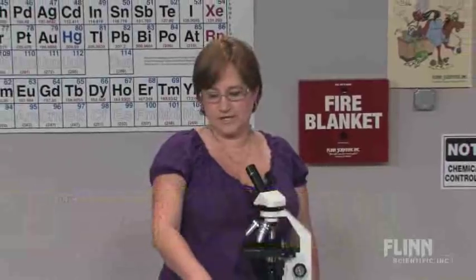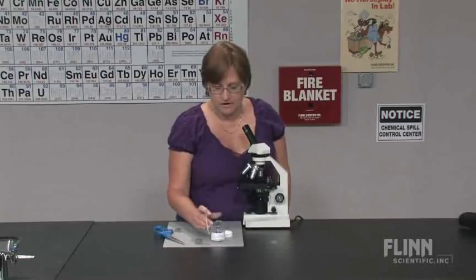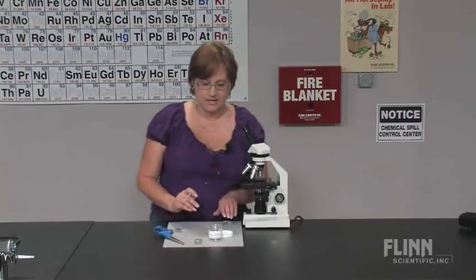Volvox is the most common colonial microorganism used in a school setting. The flagella of each individual microorganism is pointed outward from what looks like a koosh ball. They float freely in the water and they are photosynthetic.